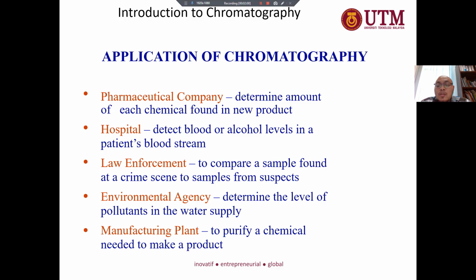They are complementary to each other, even though on paper GC looks much better compared to HPLC. But again, it's not necessarily that GC is always better than HPLC. Some of the analysis cannot be done using GC, but can be done using HPLC. Okay.